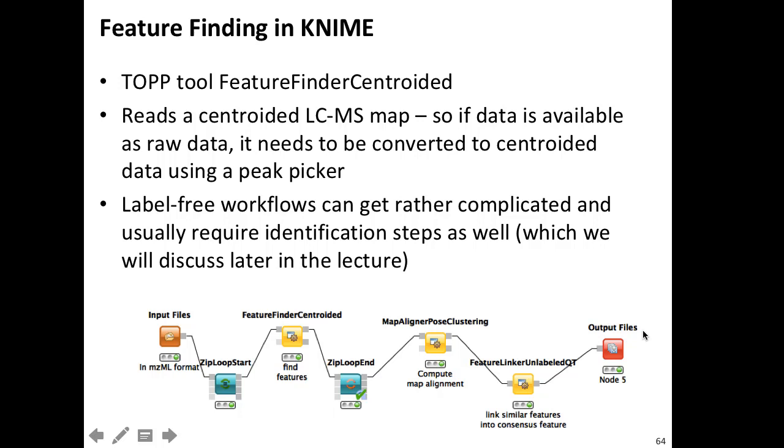That's it. It's that straightforward. But with label-free quantification, that's where the fun only starts. Then you start doing normalization, you start looking at the proteins, you start looking at batch effects and so on. But that is downstream of the feature finding. All right, I'll stop here, and I'd be happy to take any questions.